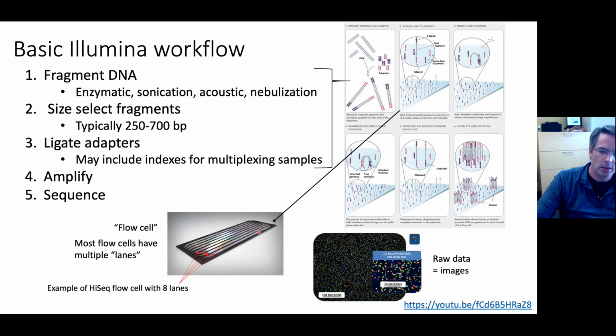This picture is a blown up version. The HiSeq flow cells are roughly the size of a microscope slide with billions of these little oligomers all over it. And there have been advances in that technology. We'll talk about the different throughput of the Illumina machines in a second.